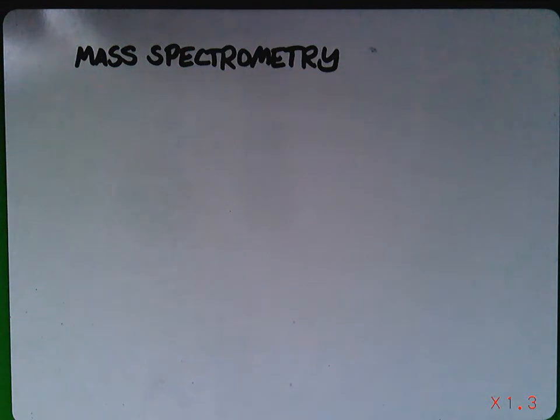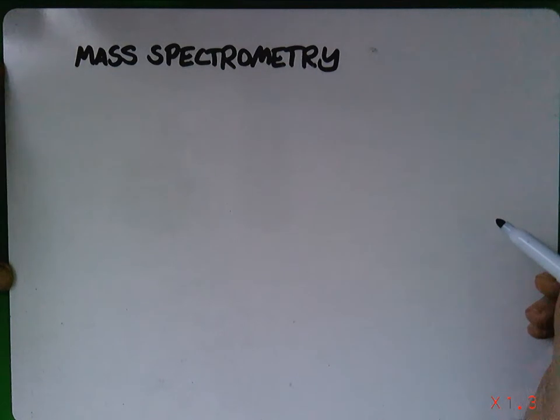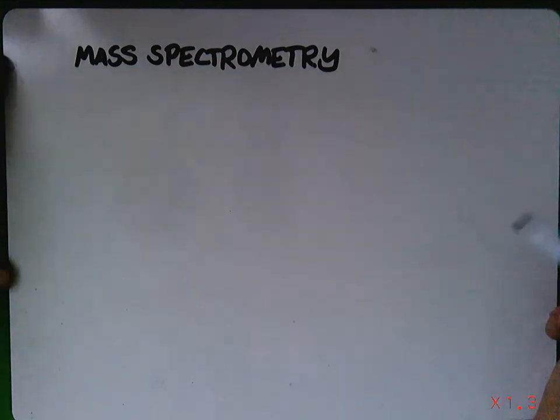So how do we measure isotopic abundances when we can't count how many atoms of an isotope we've got in a sample directly? How do we measure isotopic masses when we don't have any kind of analytical balances in the lab that can weigh masses that small? Well, we use a technique called mass spectrometry, and I'd like you to know the pieces, the steps, in how it's done. A lot of these instruments you can find on Compton Hall in our labs.